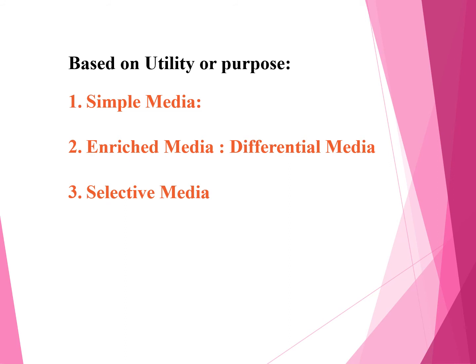For example, a differential media: certain reagents or supplements when incorporated into culture media may allow differentiation of various kinds of bacteria. This type of media is known as differential media. And the last one is selective media.